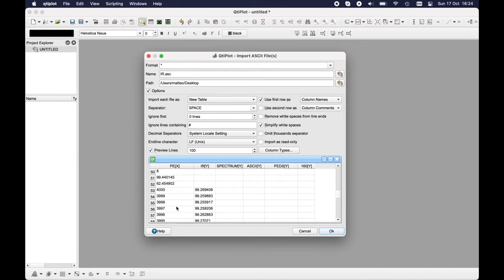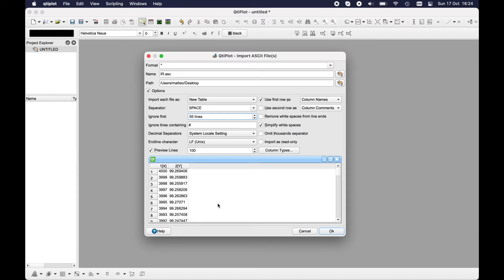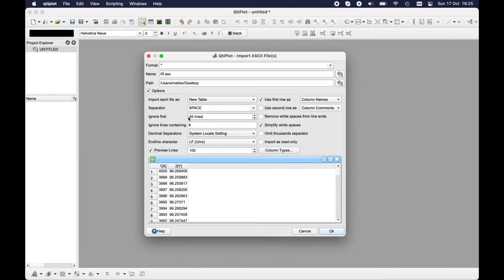So I will put here ignore first 52 lines. Let's put 55. Okay great, and here you will have the input that starts with the right amount of data, but you can also regulate it with the arrows.